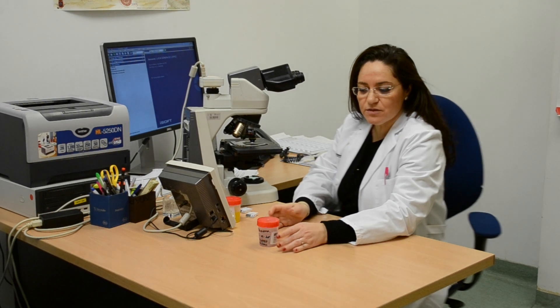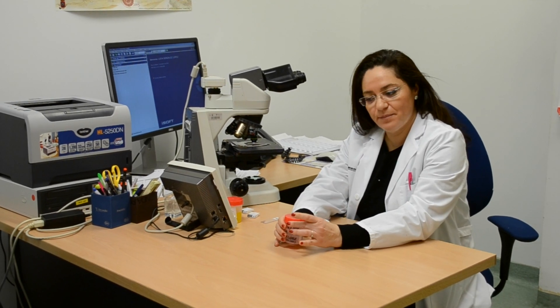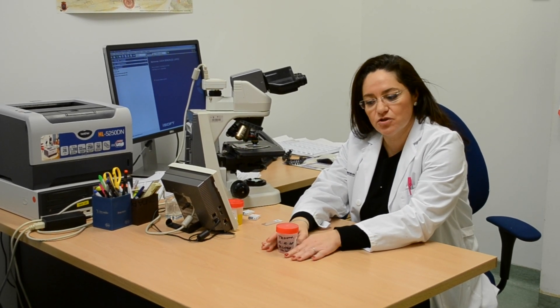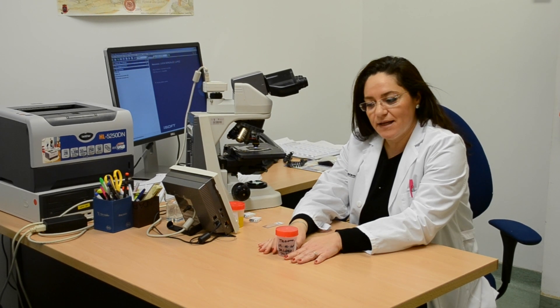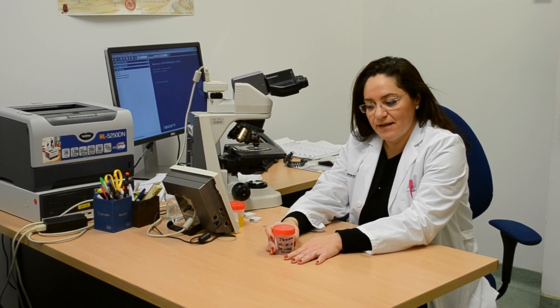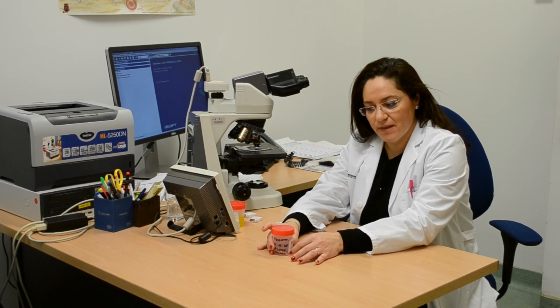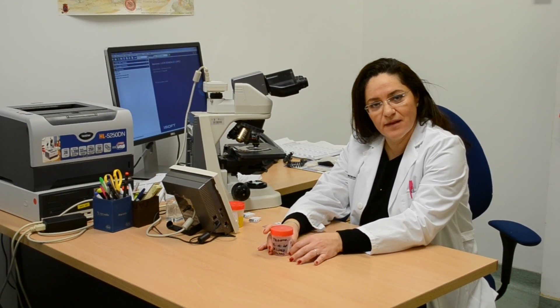There are four steps common to nearly all histological procedures. First, fixation. Second, embedding. Third, sectioning. And fourth, staining.